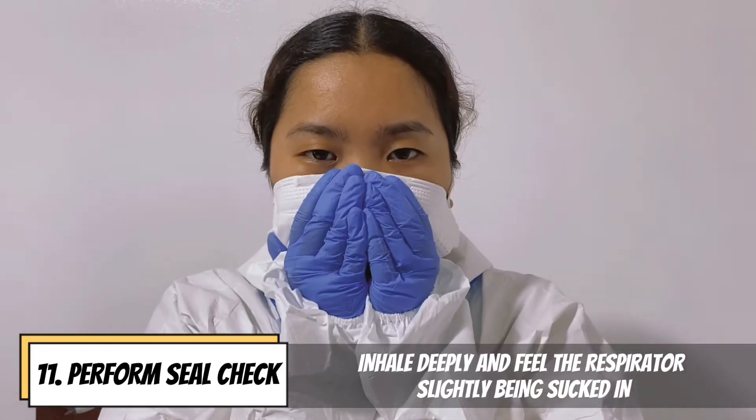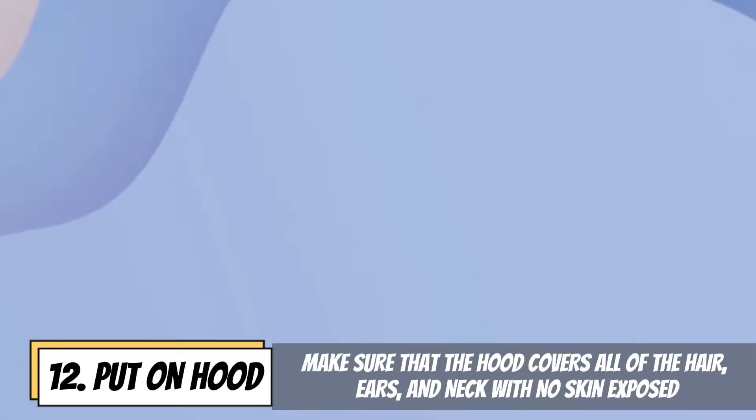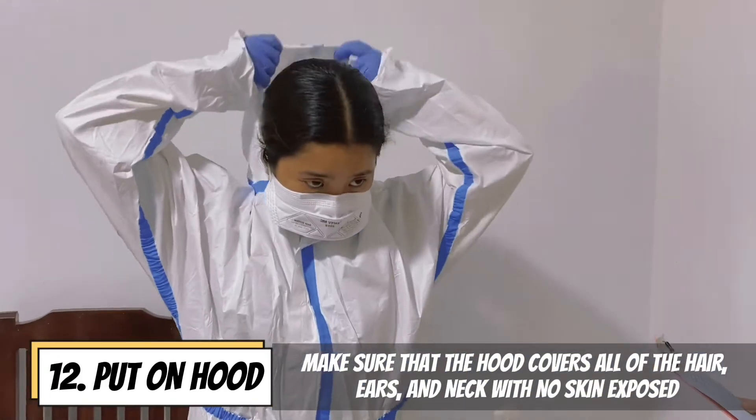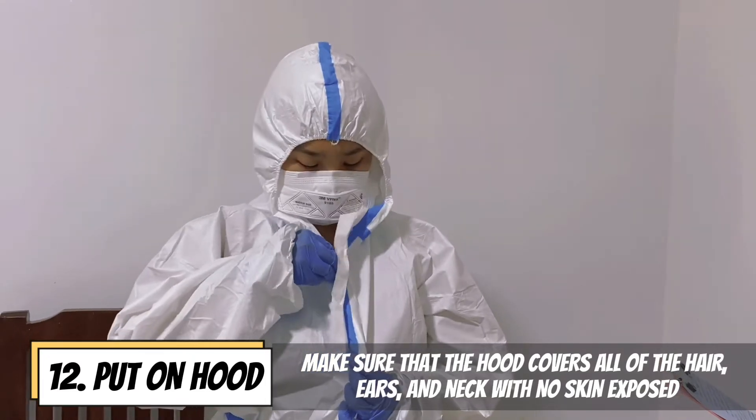Inhale deeply and feel the respirator slightly being sucked in, then exhale sharply and feel the respirator slightly bulge. Put on the hood and make sure that the hood covers all of the hair, ears, and neck with no skin exposed.